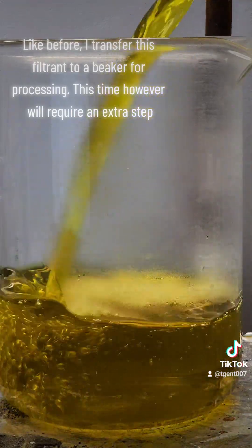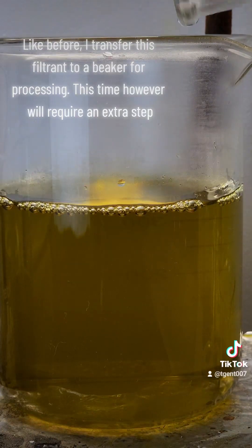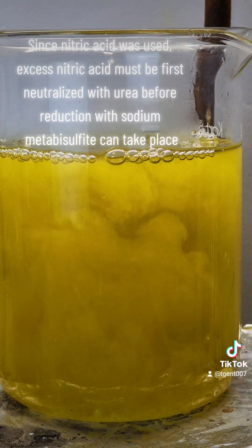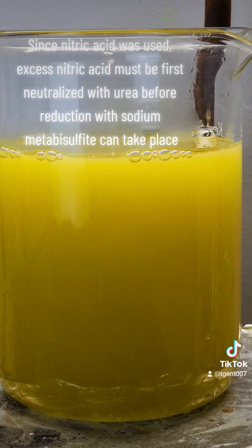Like before, I transfer this filter into a beaker for processing. This time, however, will require an extra step. Since nitric acid was used, excess nitric acid must be first neutralized with urea before reduction with sodium metabisulfite can take place.